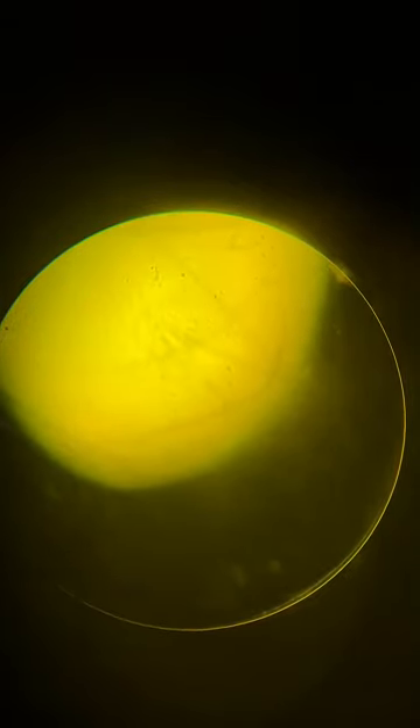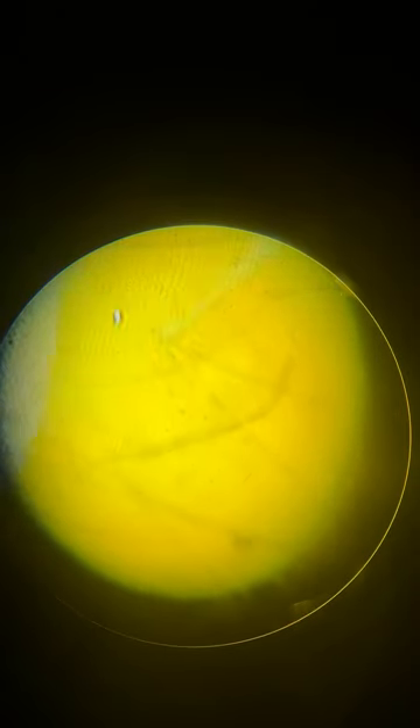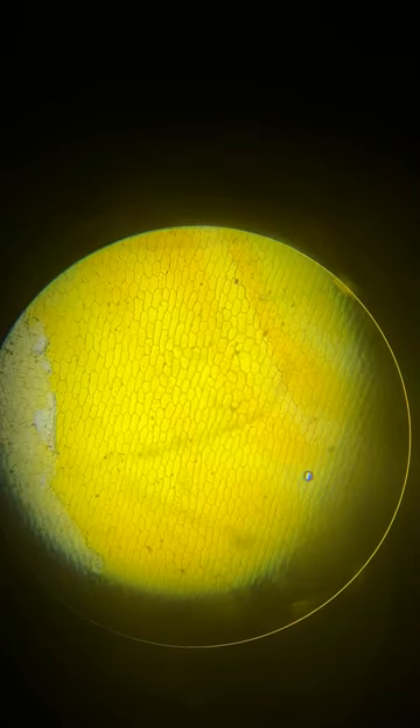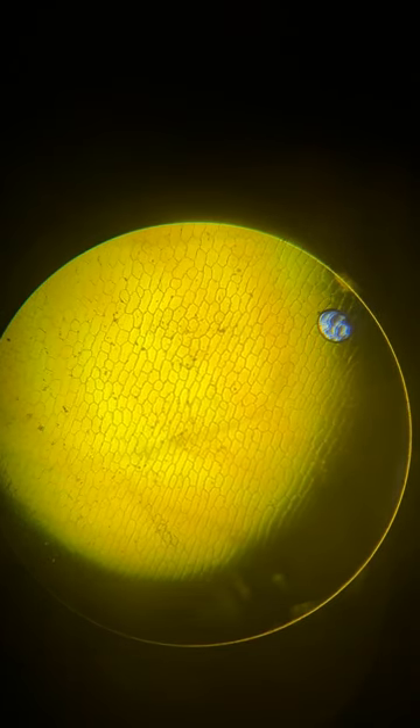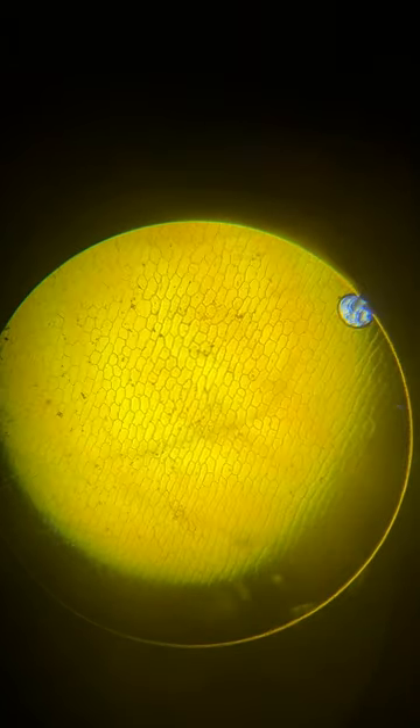The discoloration is just from iodine — sometimes it gets more stained than others. But you can see these whitish parts; they don't have a lot of iodine to them, but that's still cells. This over here might just be where it got folded upon itself and you just don't really see anything. So stay away from this. Go to where you can find the crooked bricks. This is a great spot to focus in on and begin your sketch.